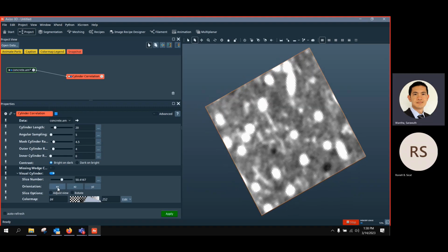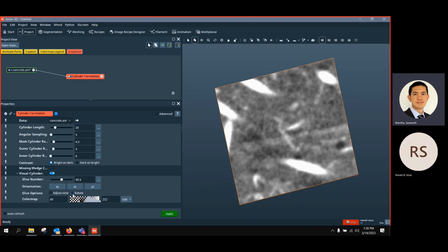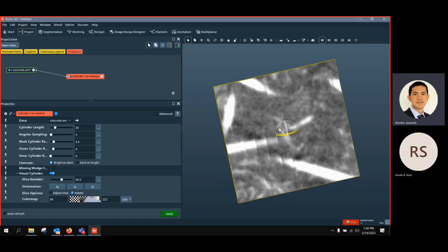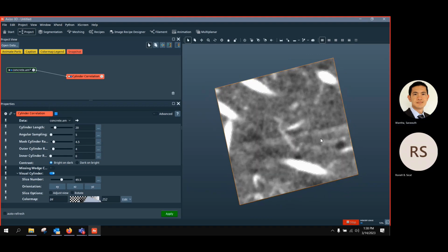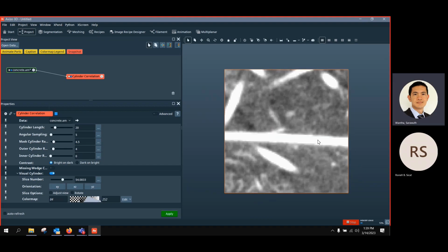So I would just stick with the XY anyway, and then you can even actually rotate this slide here. Sometimes it's not really easy to look at one plane. You might rotate until you find the representative shape of your fiber in the easiest way, but I'll just stay with XY, give it rotate. And then just maybe go to this slide here and already see a nice fiber.